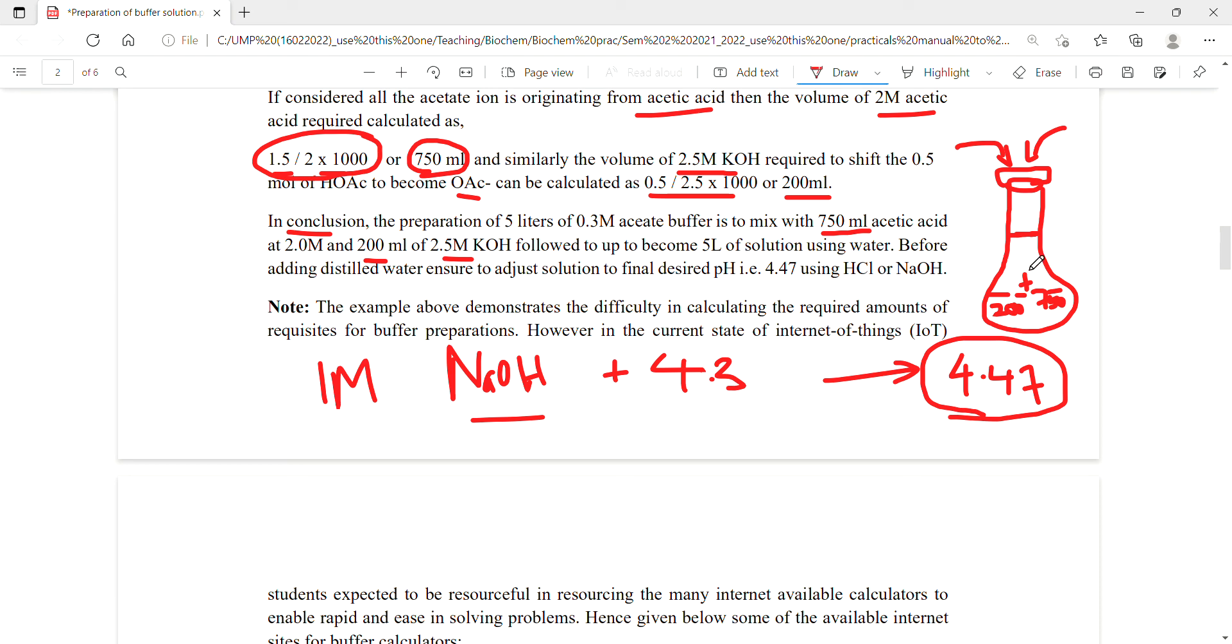So you keep adding and keep measuring the pH and then hopefully you already achieved the 4.47 target. And then what you do is, you then make sure - say you add, add become more ready - then what you do is finally you add water to make it go up to become fully at the meniscus. And therefore it is prepared to be 5 liter and that you will achieve your final target of reaching 4.47 and also in terms of the calculation to be accurate. Okay so that's preparation of buffer in the old style.